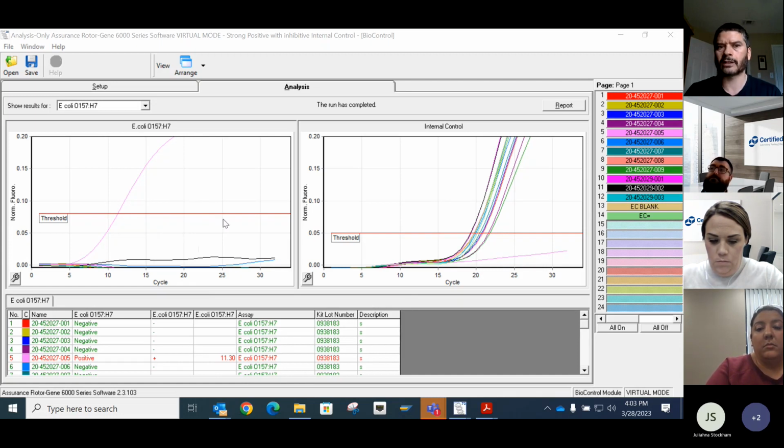So you can see this on really hot positives. Usually the CT needs to be definitely below 15 and usually closer to 10 cycles. And really anything below 10, you're going to see an IC that has very limited DNA amplification, if any. We don't always see it in E. coli. Obviously, you see it here due to the shortened enrichment time.